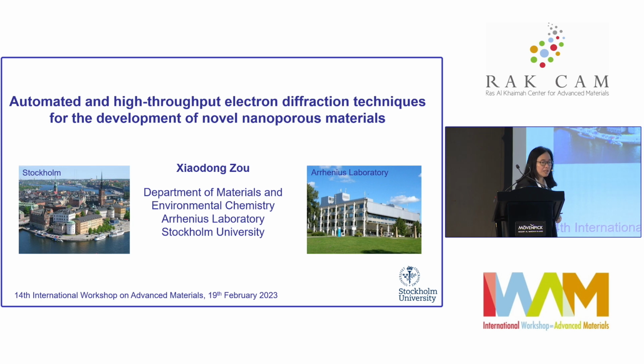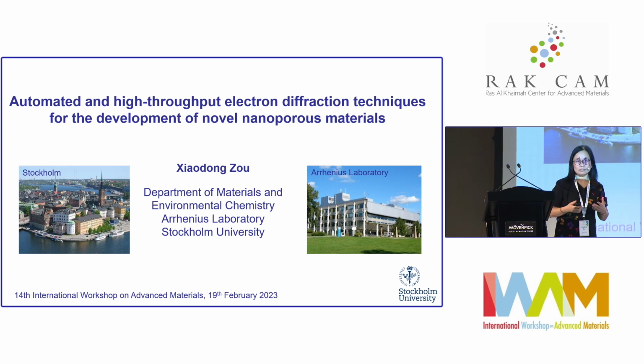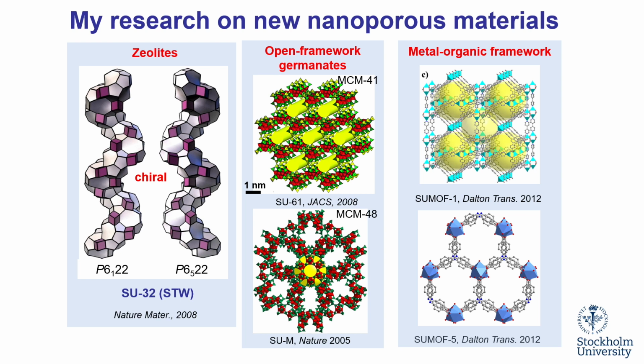So today in my talk I want to give you a new technique, which hopefully everybody can use for studying the new materials that you developed, using automated and high-throughput electron diffraction techniques. I have been working in the field of porous materials since 2000, developing new porous materials starting from open framework germanates and zeolites and metal-organic frameworks. And it has been a very nice journey.